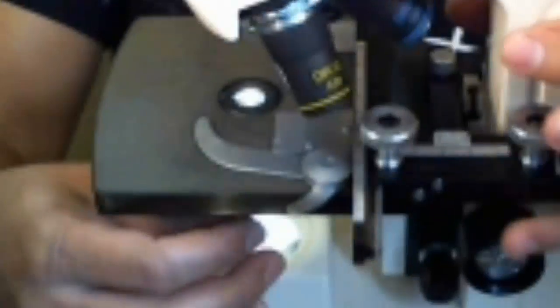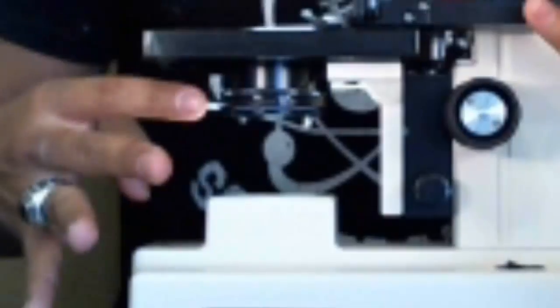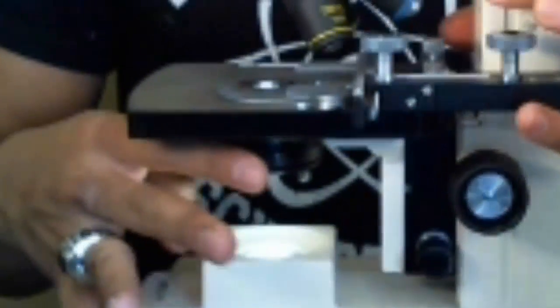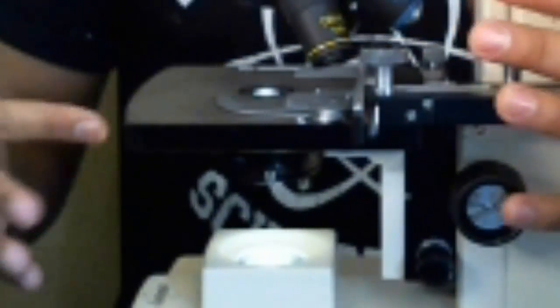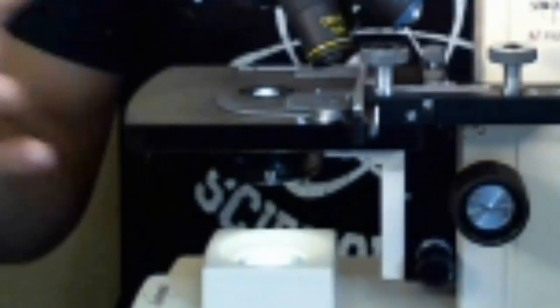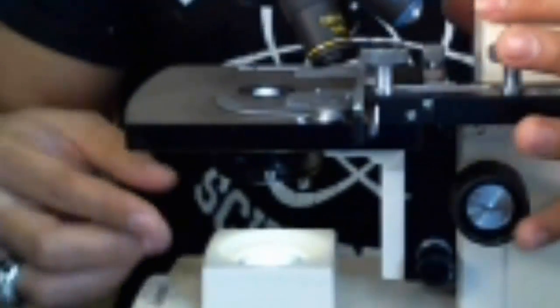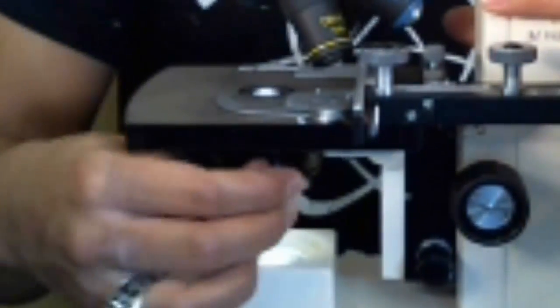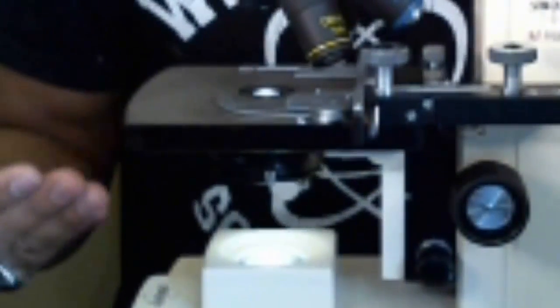You rotate the diaphragm to get just the perfect opening so the right amount of light passes through the image without overpowering it. In this model, it's a lever you use left and right. Some microscopes may have a tab at the top and front of the stage that you rotate left and right, numbered one through five — five is the largest opening and highest light intensity, one is the lowest. Either the knob at the front or the lever underneath is what we consider the diaphragm, controlling light intensity up to the eyepiece.